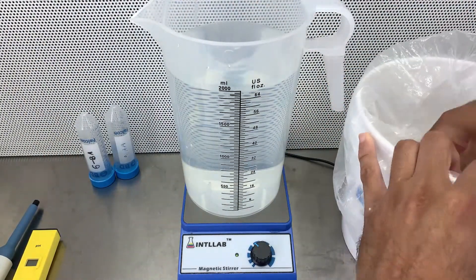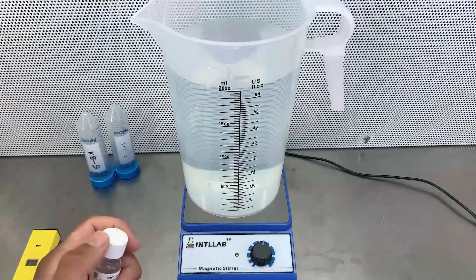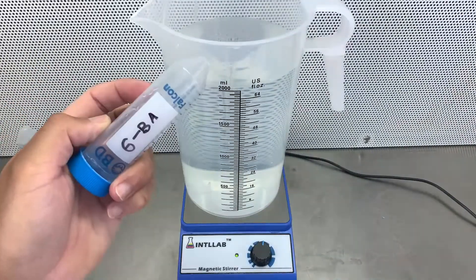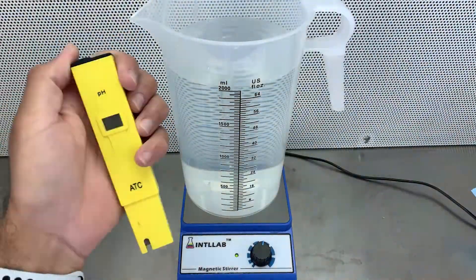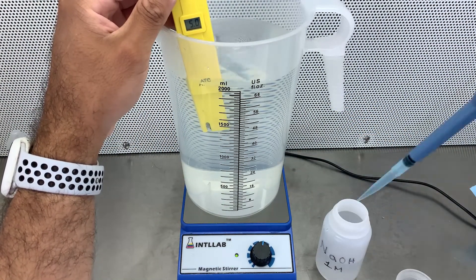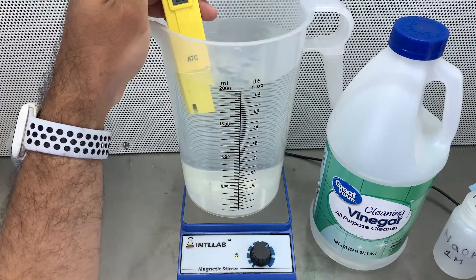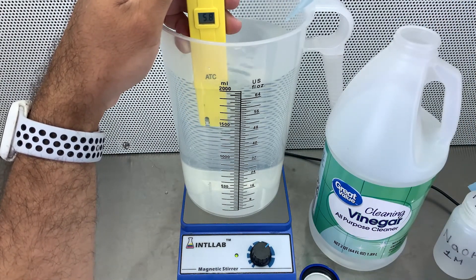Let's start with the media. I'm doing one-third MS media with 30 grams of sucrose, one milliliter per liter — in this case I'm making two liters, so I'm adding two milliliters — 0.1 milliliters per liter of NAA, and 0.1 milliliters per liter of BA.